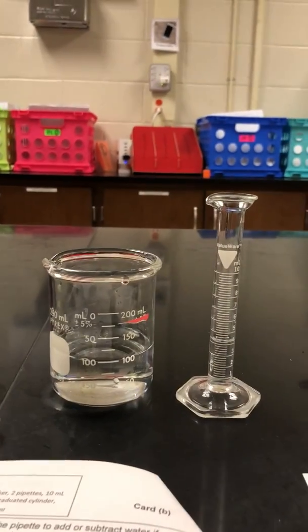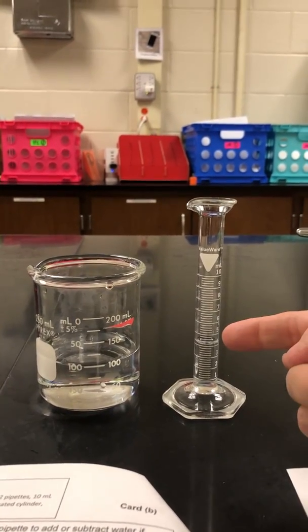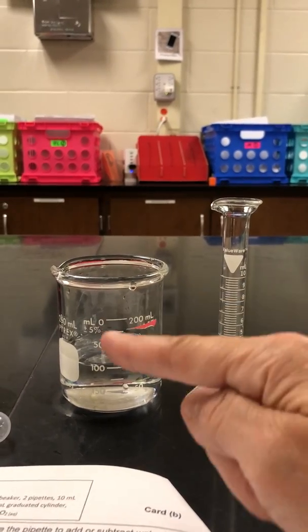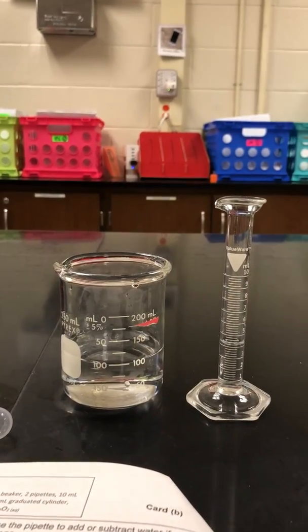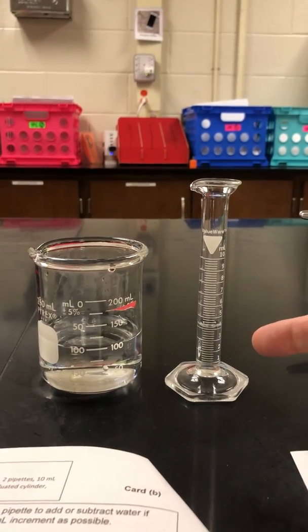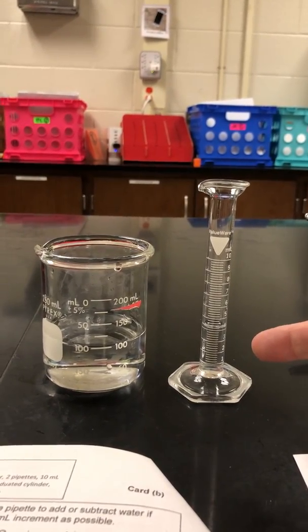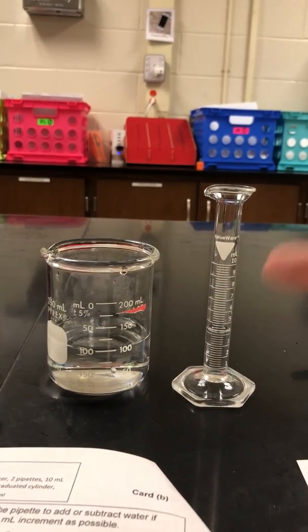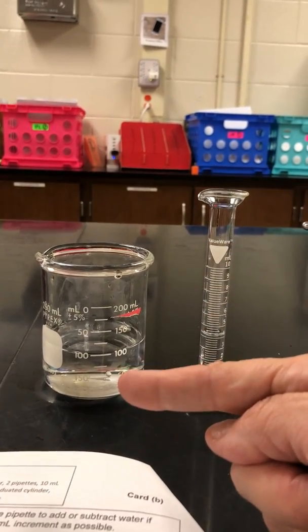Our acid is in the graduated cylinder, okay? Our water is in the beaker. We have 100 mils of water and 4.2 mils of acid. So what we're considering is, do I add this to this, water to acid, or acid to water?